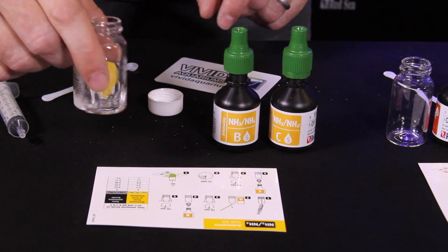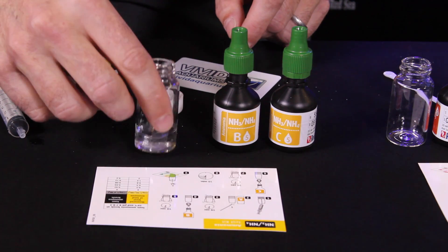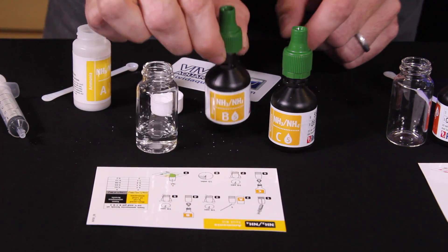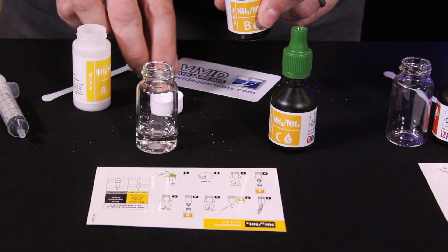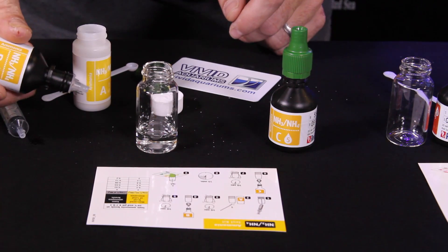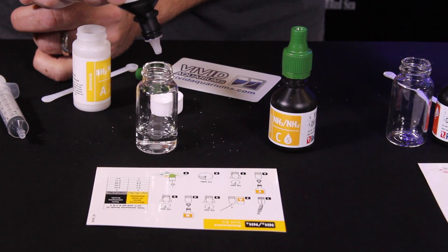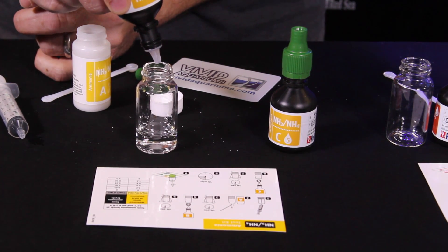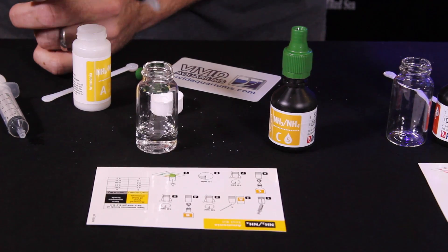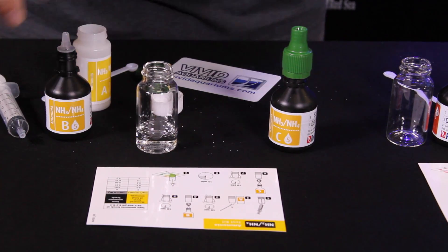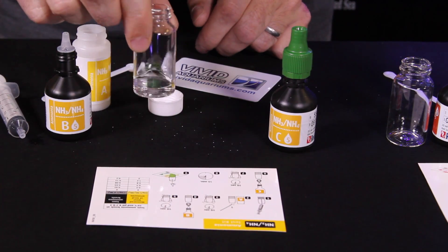And then next step is going to be to add five drops of reagent B. Now anytime you're adding drops of a reagent, I recommend turning the reagent bottle upside down next to the test vial and then moving it over so you get five even drops. One, two, three, four, five.